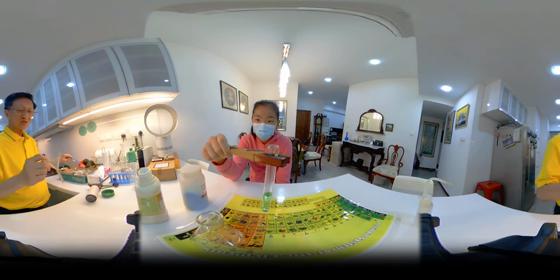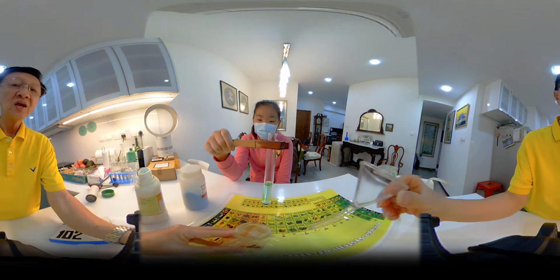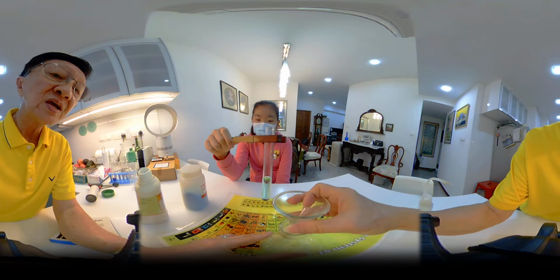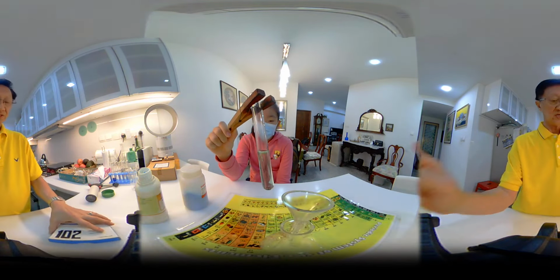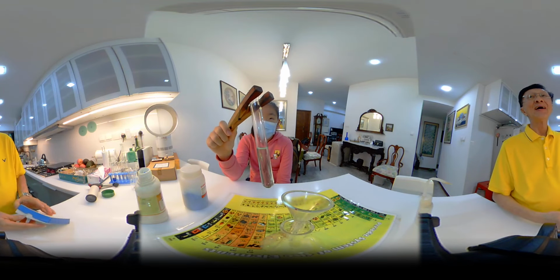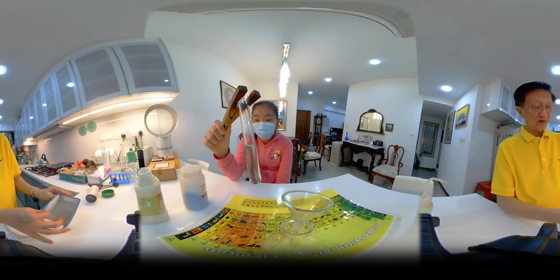Then we use, what do you call this? Filter funnel. That's right.